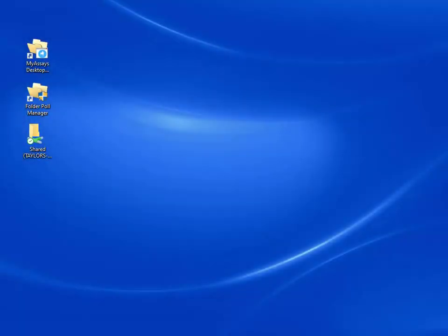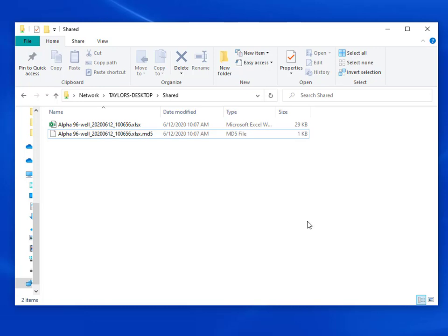In this video, I'll demonstrate how to configure folder poll functionality to automate your data analysis from the Victor Nivo software to MyAssays Desktop Pro. I have a shared folder on my network. And this is the folder we'll set the Nivo software to export data files to.